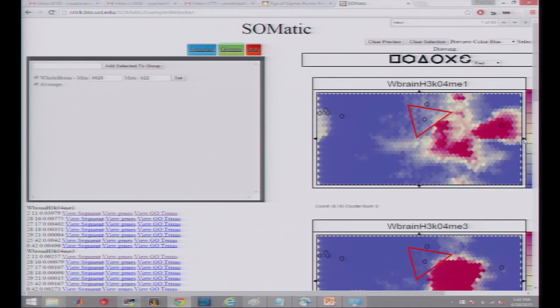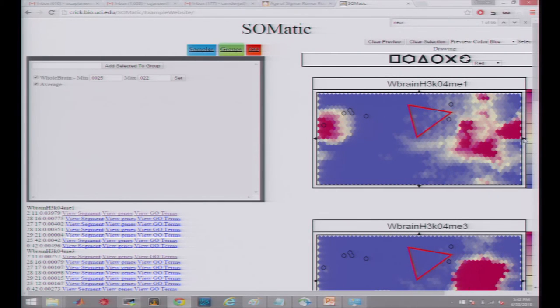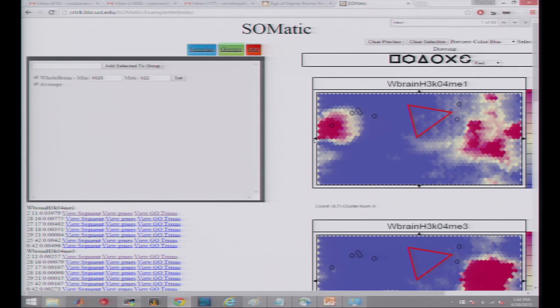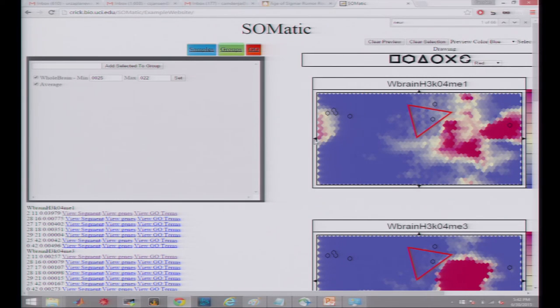Another question was about how you know when you've explored all the space on a toroid. The answer is that the website shows a rectangular representation of the full toroid — if you take the top and bottom and wrap them around, and the left and right and wrap them around, you get the toroid. So you're automatically seeing the whole thing. The arrows let you reposition the view so that clusters that appear split across the edge can be moved to be viewed together in the center.